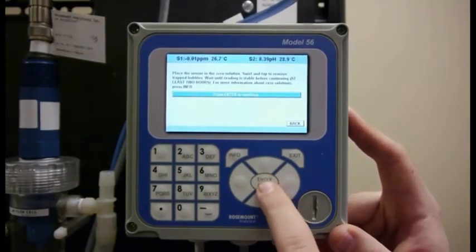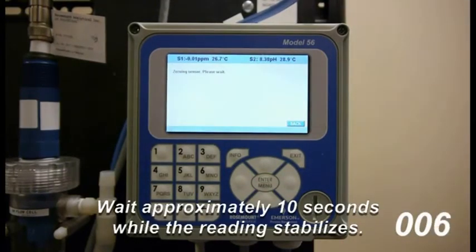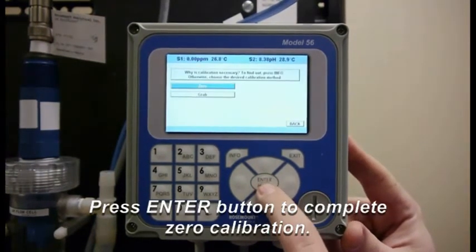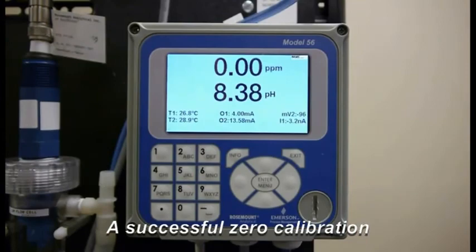I'm going to hit Enter for the zero calibration and it's going to tell me to wait for about 10 seconds. I'm going to hit Enter for accepting the zero calibration and then I'm going to hit Exit and go back to the start. Now I have set my zero for the sensor.